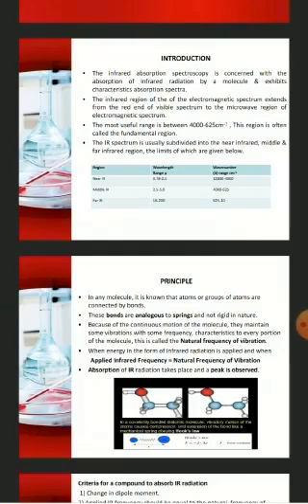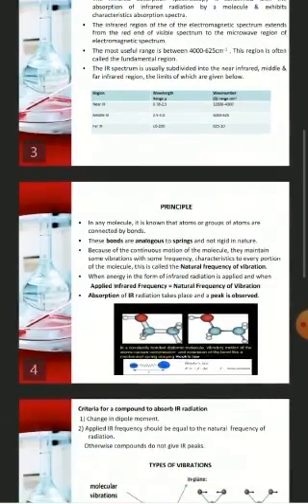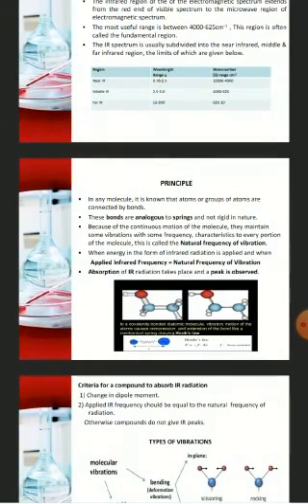This region is often called the fundamental region from the standpoint of both application and instrumentation. The IR spectrum is usually subdivided into the near infrared, middle infrared and far infrared regions.